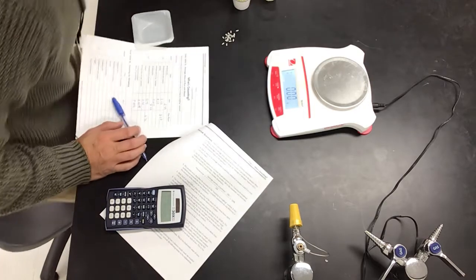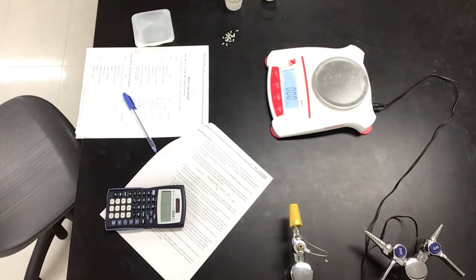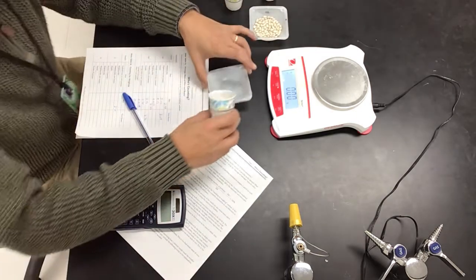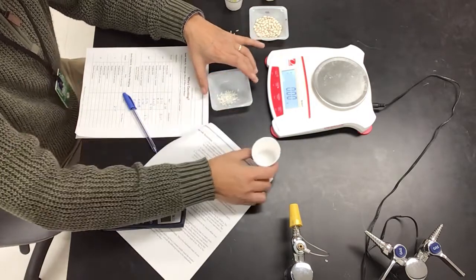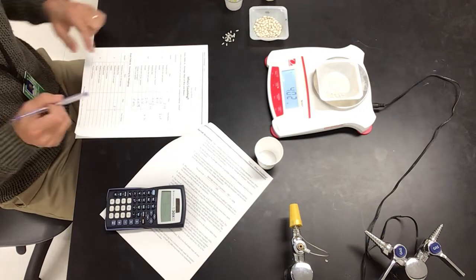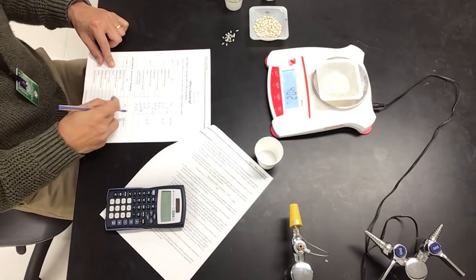Where's my 100 grains of rice? Ooh, all right, over here. To save time, I already counted them out. This is 100 grains of rice. I'm going to pour it in there. The mass, weighing dish and sample, is 4.02 grams. You're going to fill out the rest.